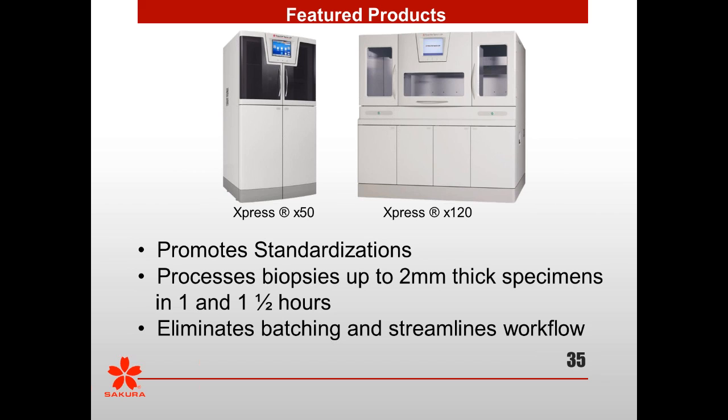Thank you, Bill. The next question is, what is the stabilizing reagent you mentioned? The stabilizing reagent, and again, it's kind of hard. If you're using resection tissues, your stabilizing holding reagent is typically your formalin, so that you get adequate fixation. If you have small biopsies, I suggest more of a molecular-friendly fixative, so that you stop the formalin fixation and move it into more of an alcoholic fixative.